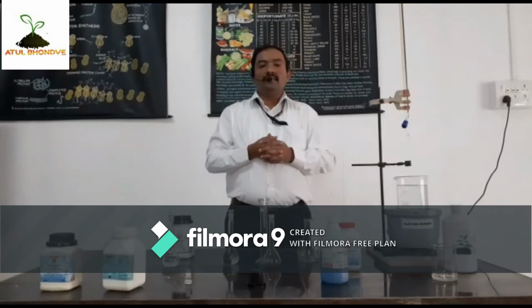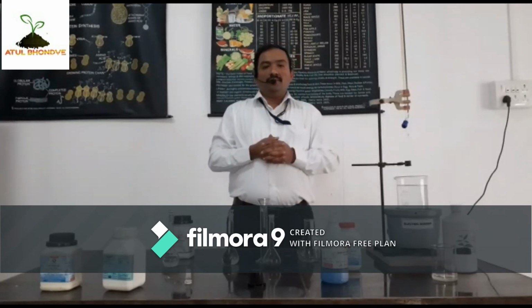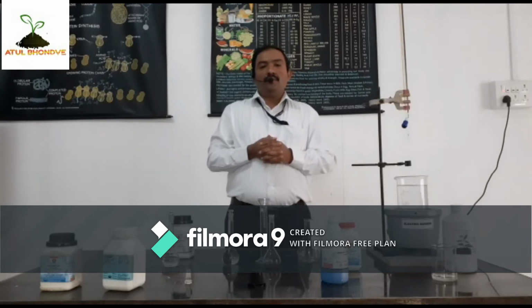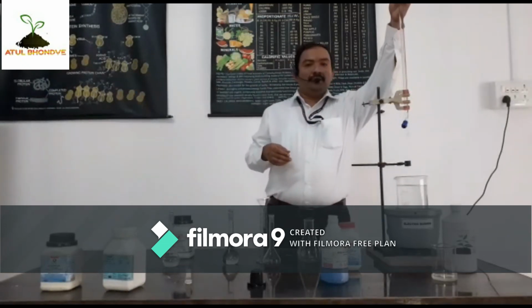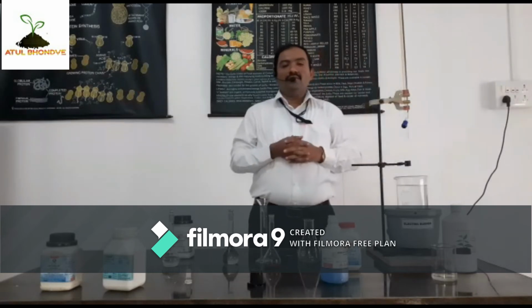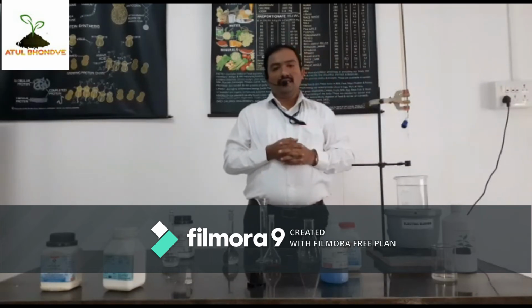This indicates the first part of this procedure is over, that is the complete reduction of Benedict's reagent by the glucose solution. Note down the burette reading, and we will use this reading for the calculation part.